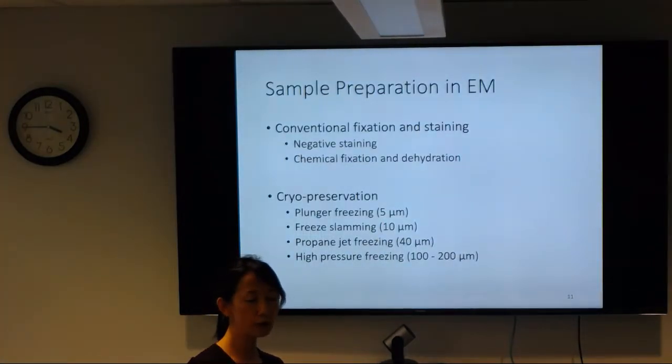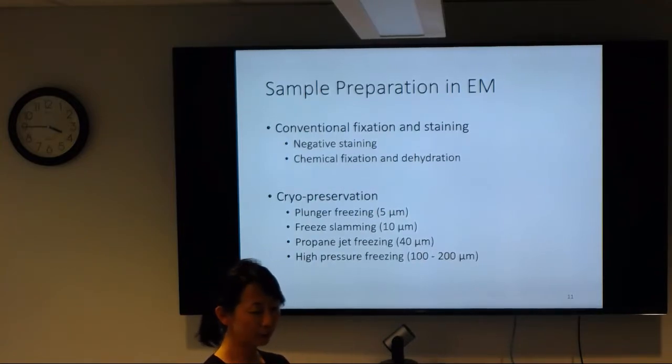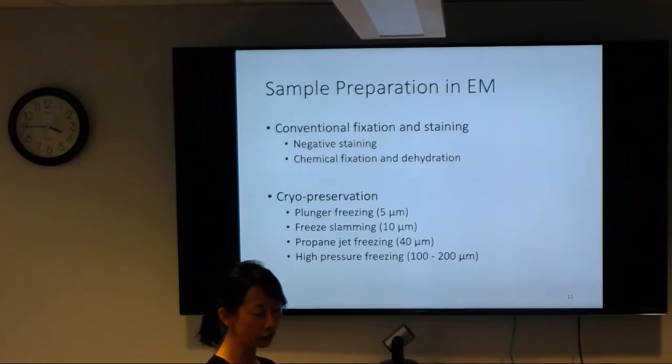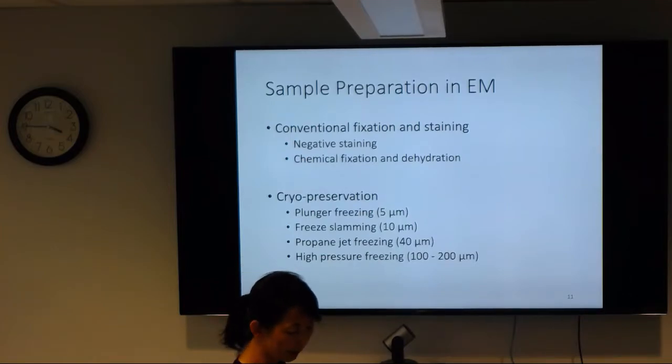There are two different ways of preserving samples. Conventional, I'm not going to mention at all, since it's not that interesting in this lecture. For cryopreservation, we have plunge freezing, and we also have high pressure freezing. I want to mention those because they are the two most used sample preparation procedures for tomography applications.